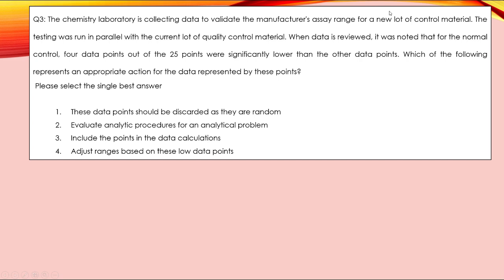1. These data points should be discarded as they are random. 2. Evaluate analytic procedures for an analytical problem. 3. Include the points in the data calculations. 4. Adjust ranges based on these low data points.